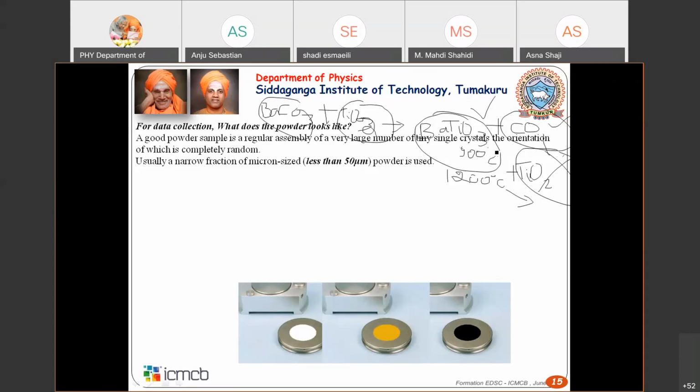You may be having some other oxides which may be black. Okay, so copper oxide, for example, is simple in simple terms. You can also have like praseodymium, strontium, manganese oxide, all those things. They will be in different color. So this is one more sample which is with some yellow color. Okay. So in this case, as you can see, there is a depth here.